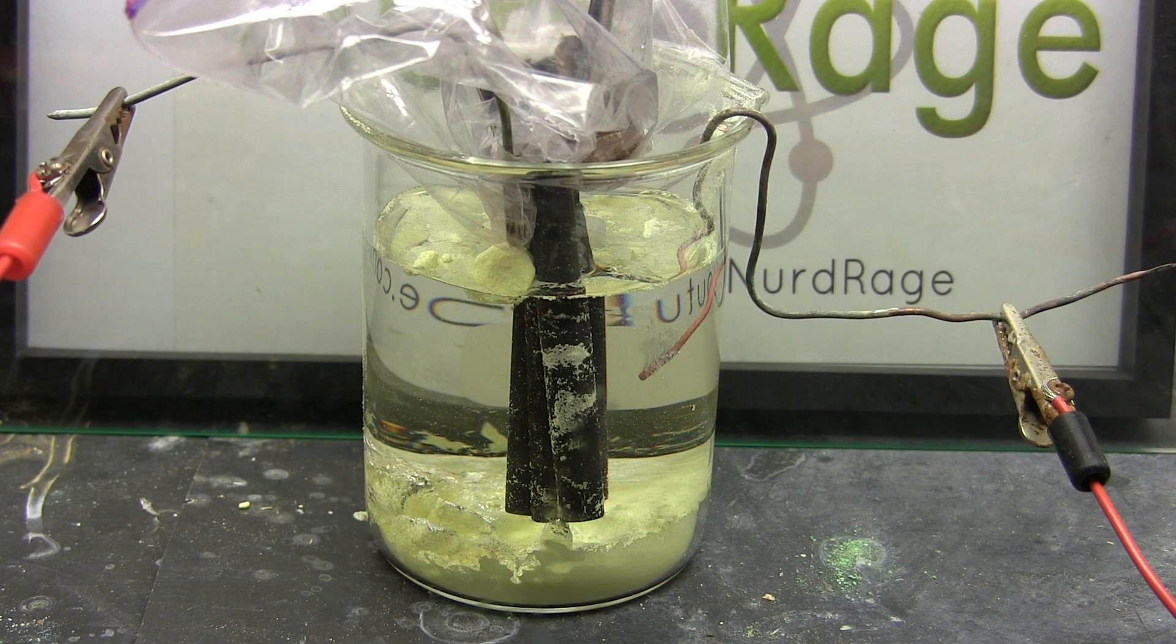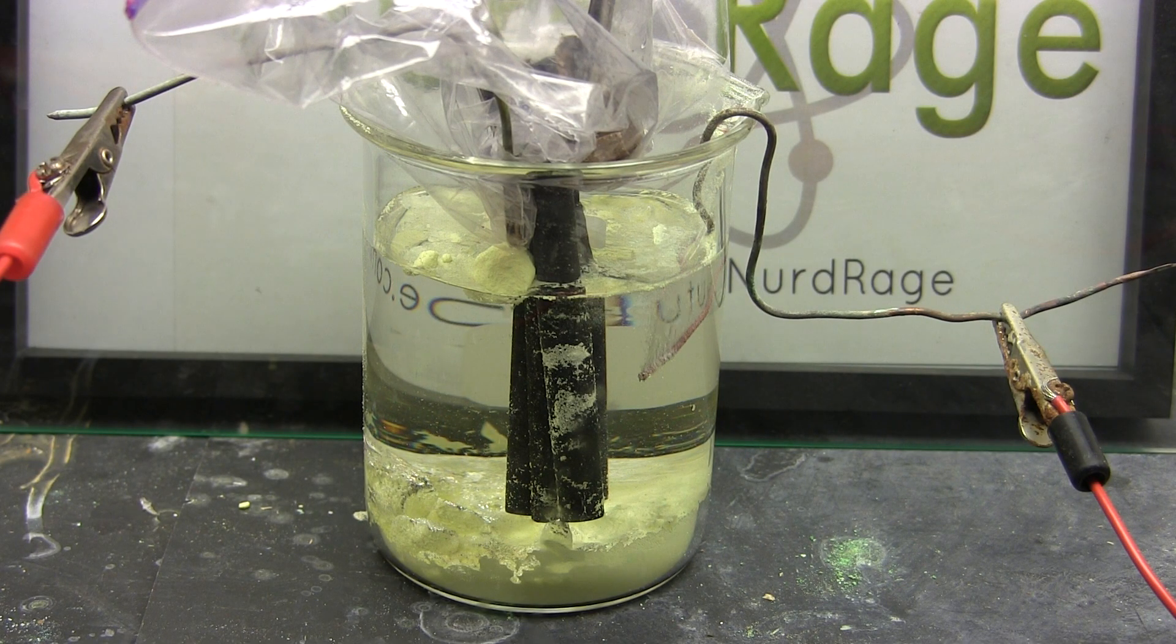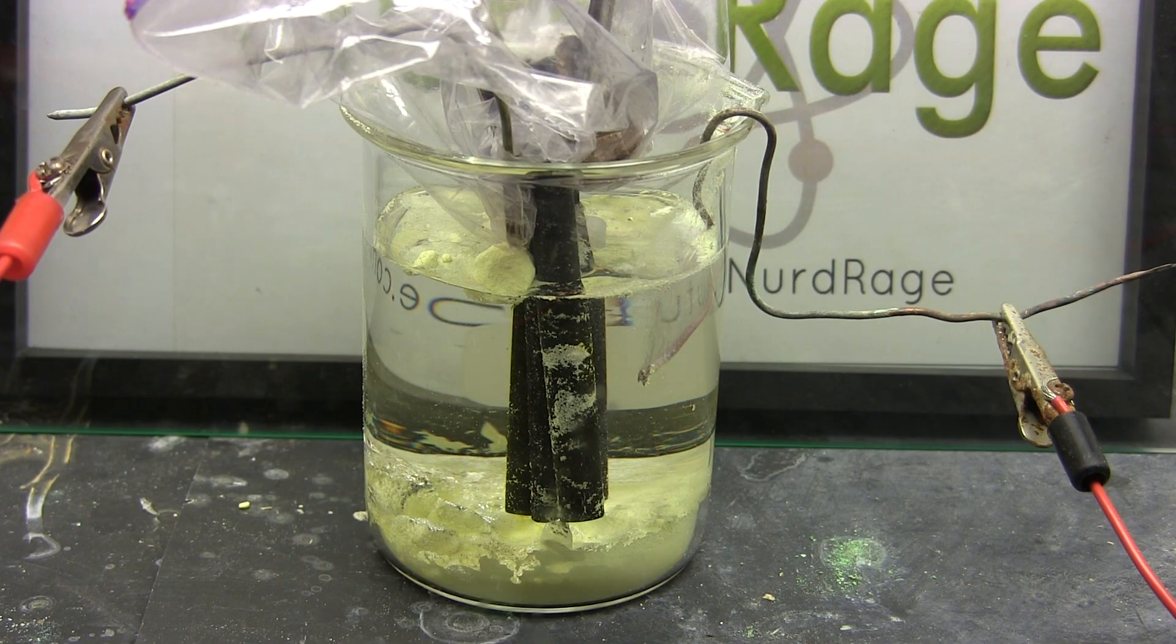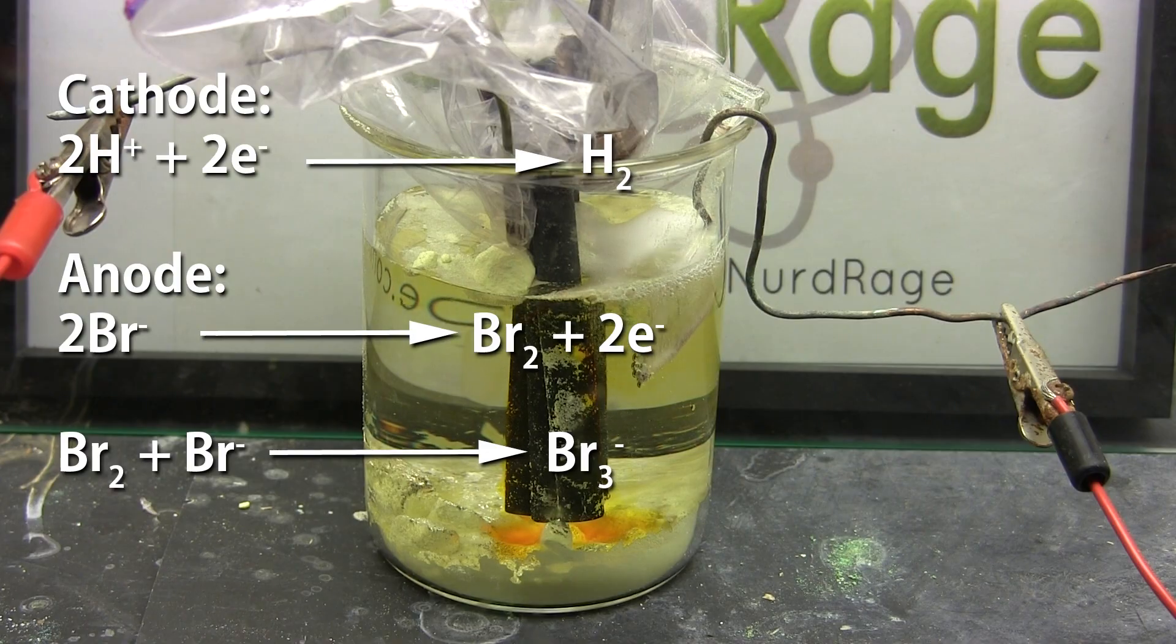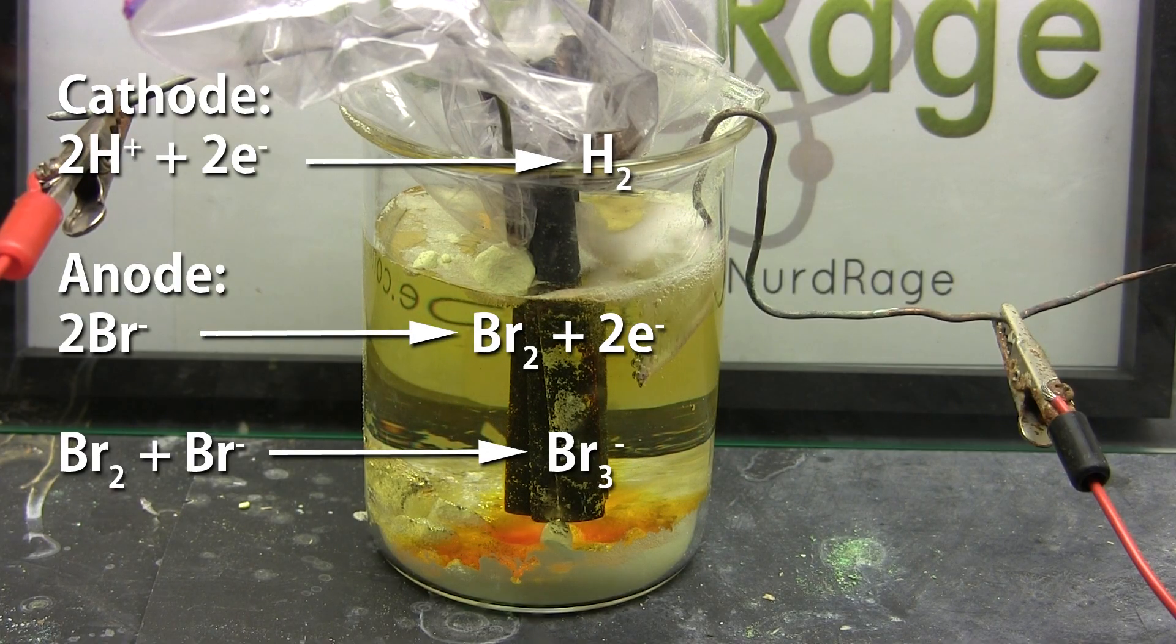Now we turn on the current. I'm using 2 amps. This might be too much but this is the first time I'm doing this so gotta start somewhere. What's happening is that at the cathode we're generating hydrogen gas. At the anode we're oxidizing the bromide ions to bromine.